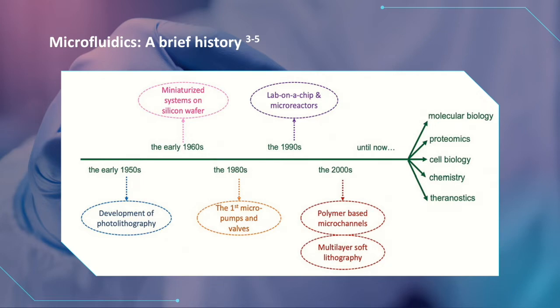By the 2000s, polymer-based microchannels and multi-layer soft lithography were beginning to emerge, and these technologies helped to make microfluidics much more inexpensive. Currently, microfluidics are involved within a variety of fields, such as molecular biology, proteomics, cell biology, chemistry, theranostics, as well as point-of-care diagnostics.